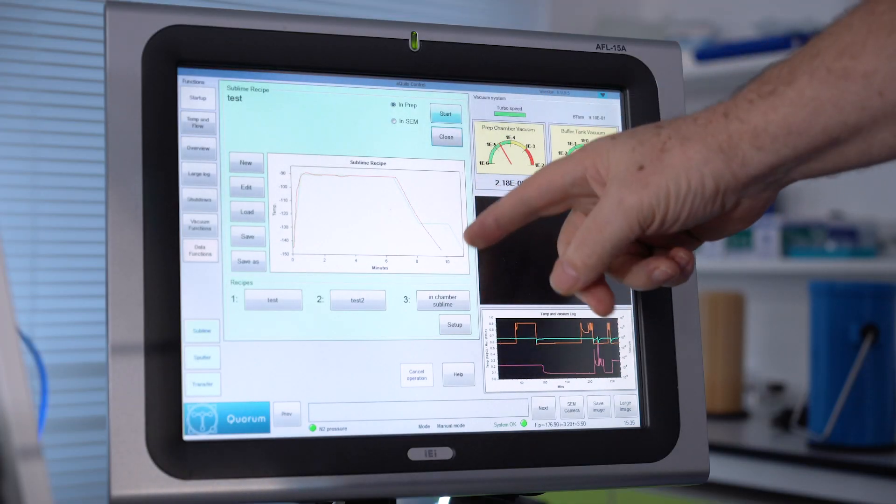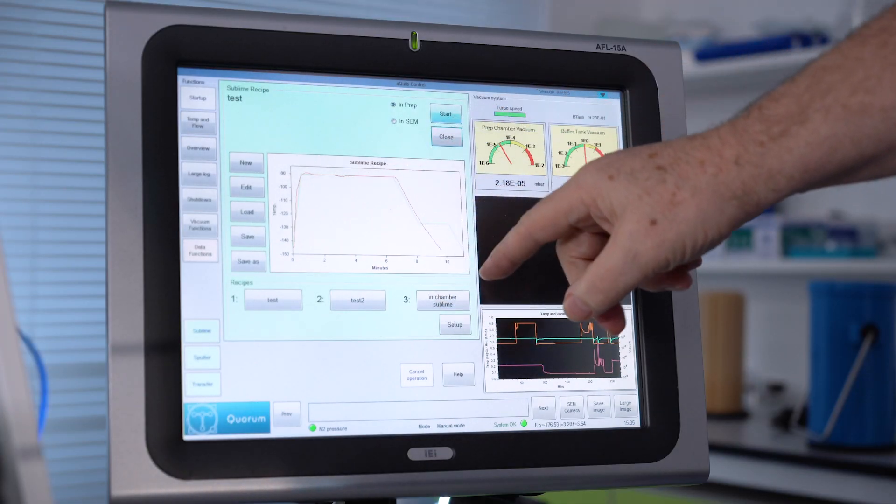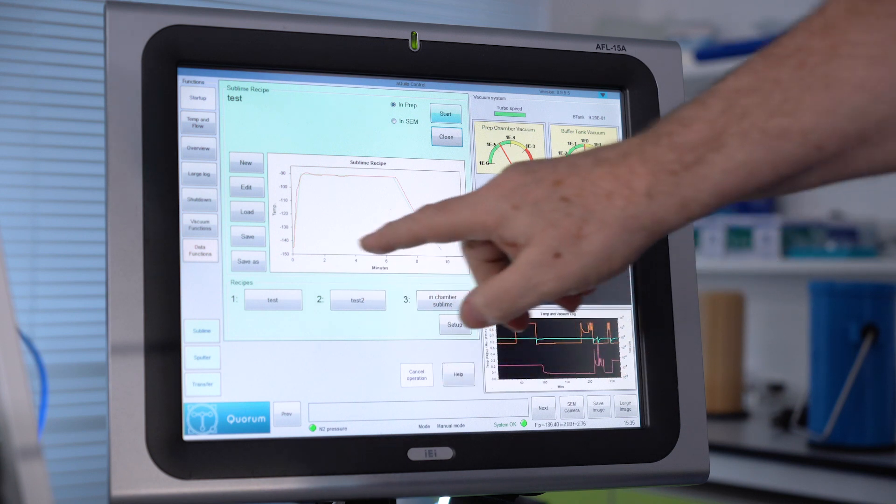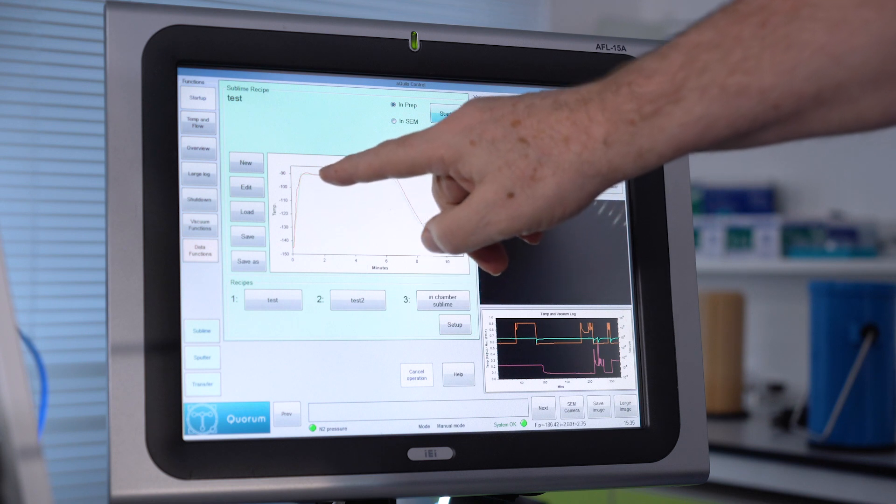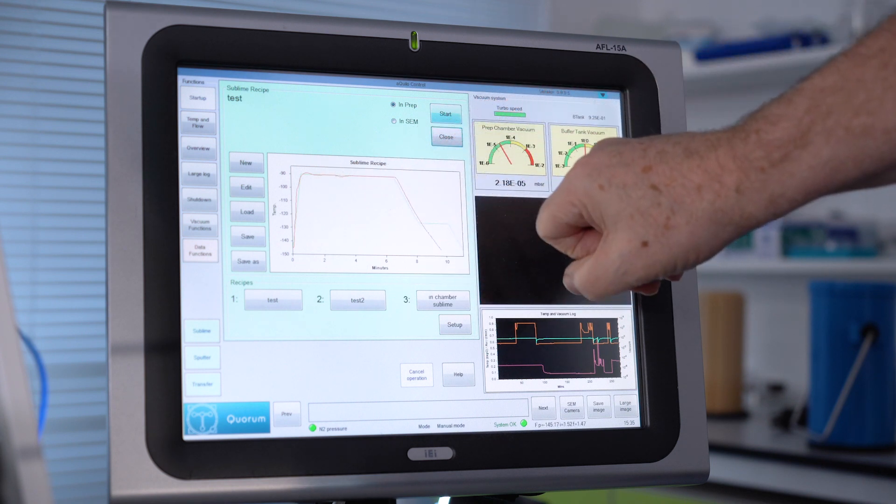So here we can see our defined sublimation curve with one of the recipes we have chosen here. The green line is what we defined and the red line is what the sample actually experienced during the sublimation.